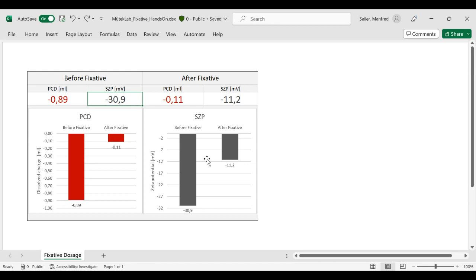So what would happen if we would even further overdose this cationic fixative? The fibers are still available as reaction partners, still anionic. At a certain point, they will be turning cationic, strongly cationic. Only if the overcharged cationic fibers start even repulsing the fixing agent, then we would be able to see free cationic fixative in the filtrate.